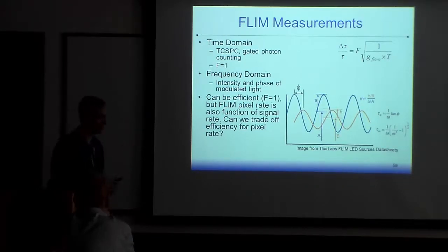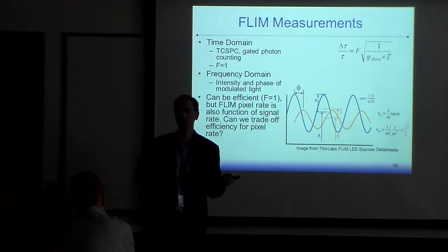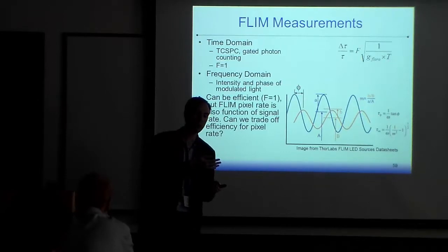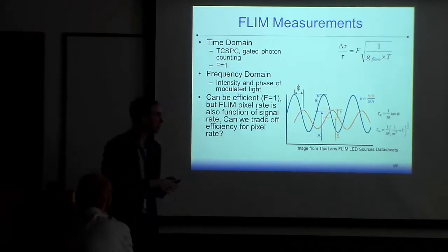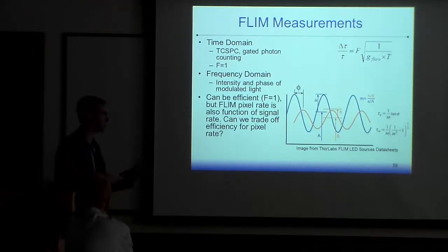Another way you could do this is if you think about your fluorophore as basically an RLC circuit, or any type of circuit with a time constant. You know the frequency response of the circuit: as you approach the decay time of your circuit, you're going to have a decrease in amplitude of your signal through this filter, and you're going to have a phase offset. It's the same math. You can work this out and measure it. If you measure this phase offset, you can back calculate the lifetime of your circuit, or of your fluorophore. This is the technique that we'll mostly use.